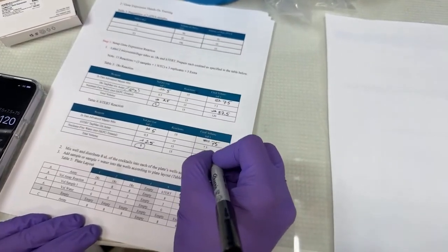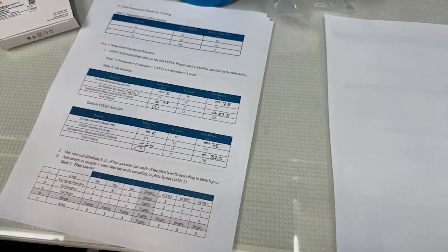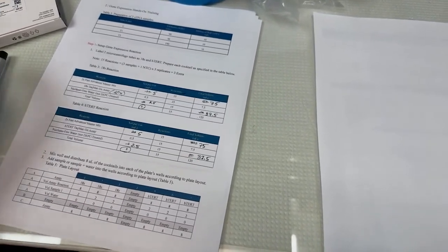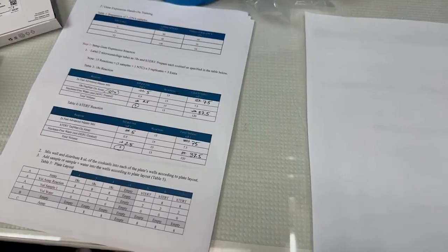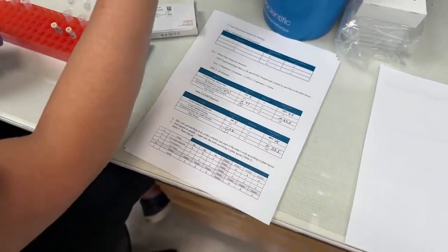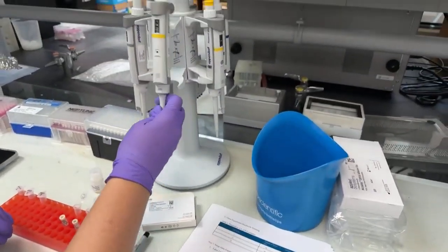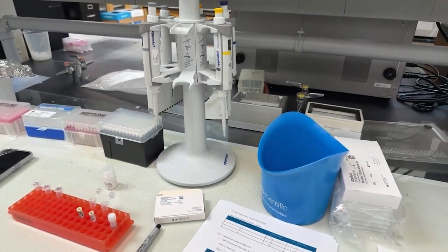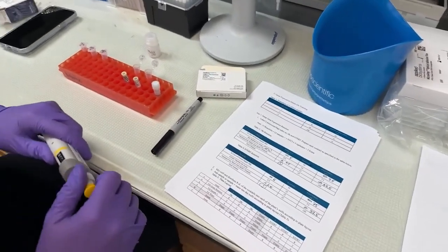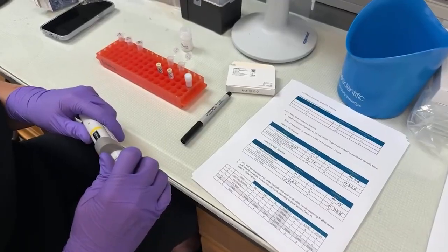So what I'm actually going to pipette now is everything together in a bulk solution except my individual samples. It's always more accurate to pipette larger volumes than it is a whole bunch of small volumes. So this is a good approach to, number one, reduce variability and increase performance. So 75 microliters of my 2X master mix.